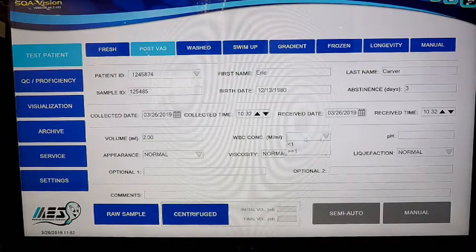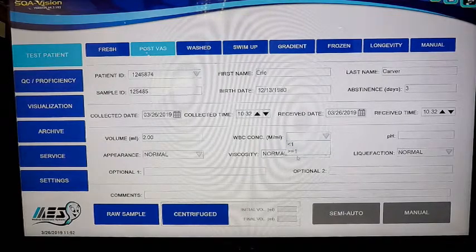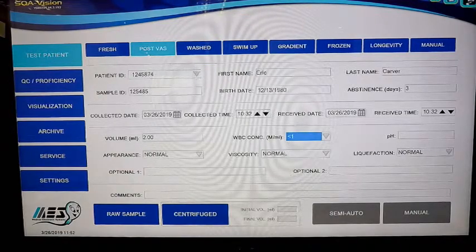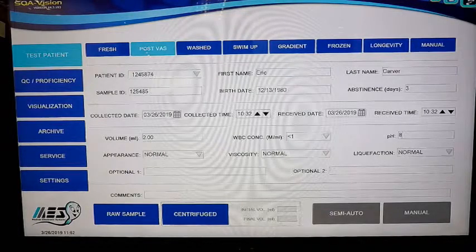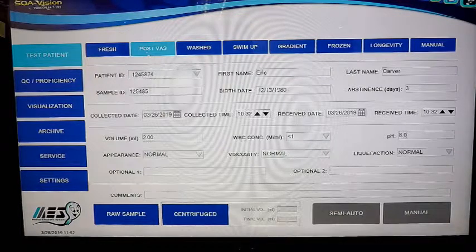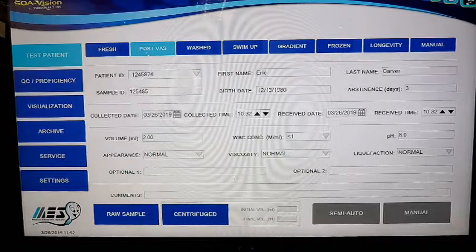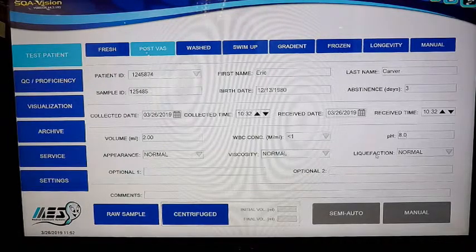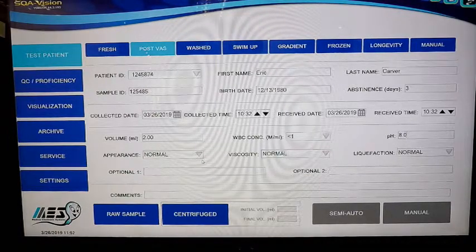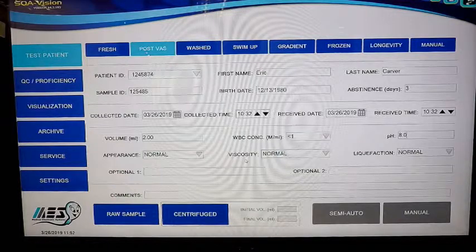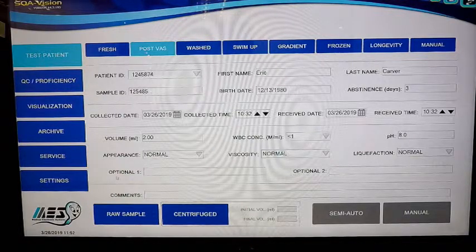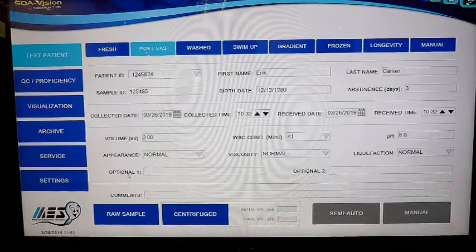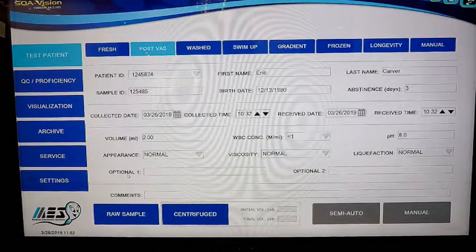You can test for white blood cells, similar to other sample types, and pH. You can use our test strips for both parameters. Appearance, viscosity, and liquefaction are up to you as you process the sample. If you notice anything unusual or if it takes a while to liquefy, you can put in those options. You have two fields that you can custom program as with all other sample types.